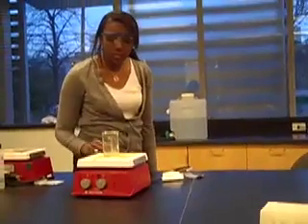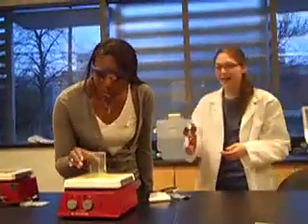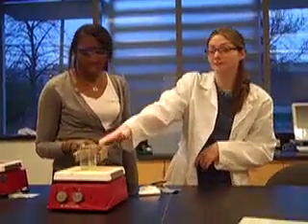Wait a minute, Steph. You should never grab hot glass with your bare hands. Always use a mitt or tongs.